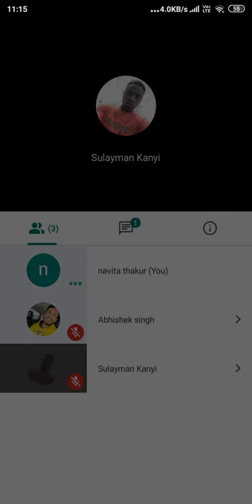Actually, the water which we drink and the water which we use in a biochemistry lab is different. In a biochemistry lab, we use distilled water. For that, I already shared a video in your group. Might be you didn't watch that video yet, but I request please watch that video once.